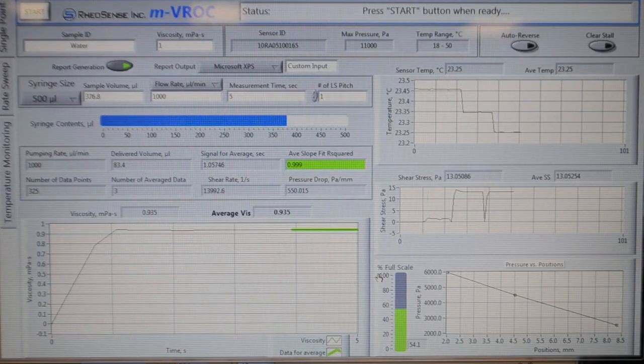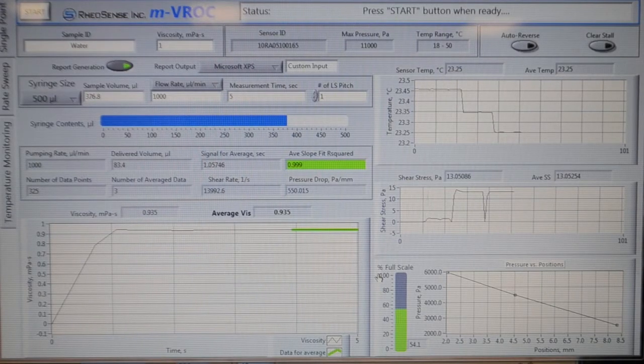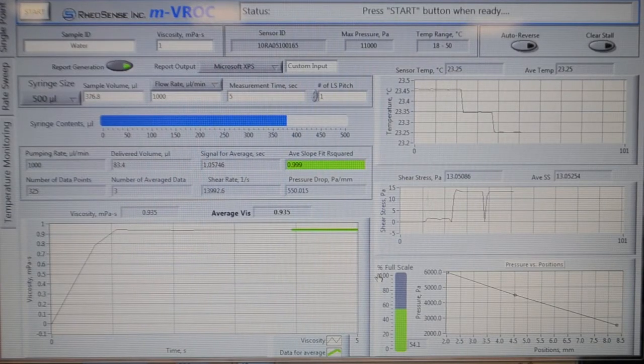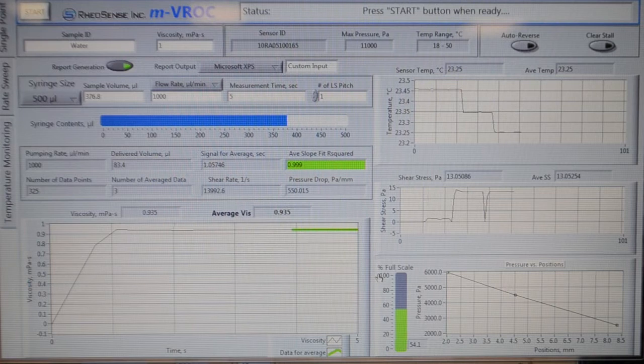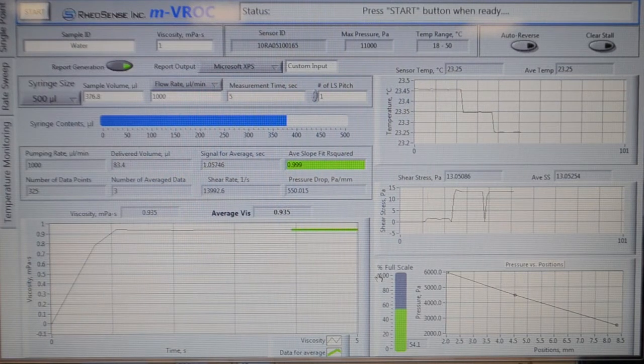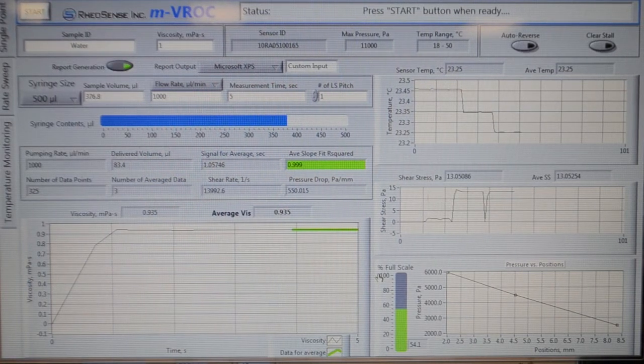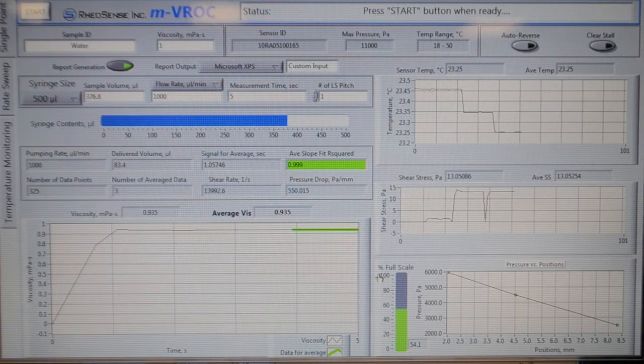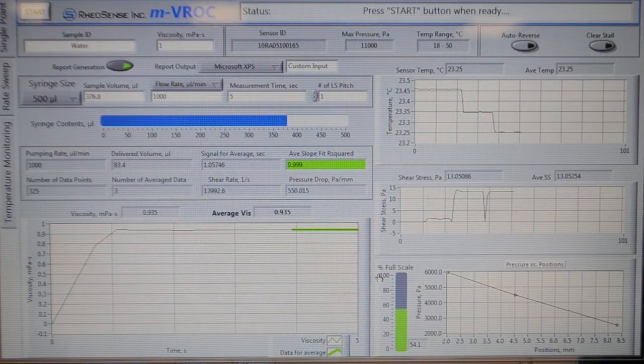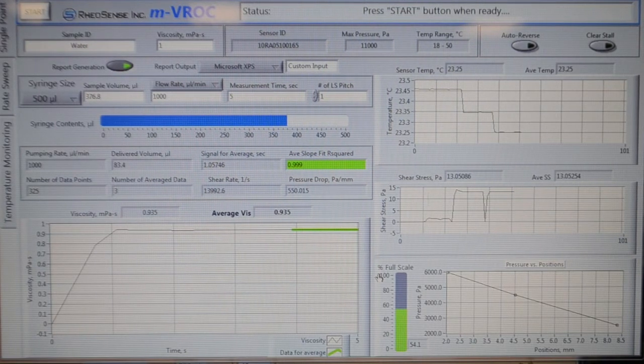That was the end of our single point measurement, and we may proceed to step 5, rate sweep measurement.